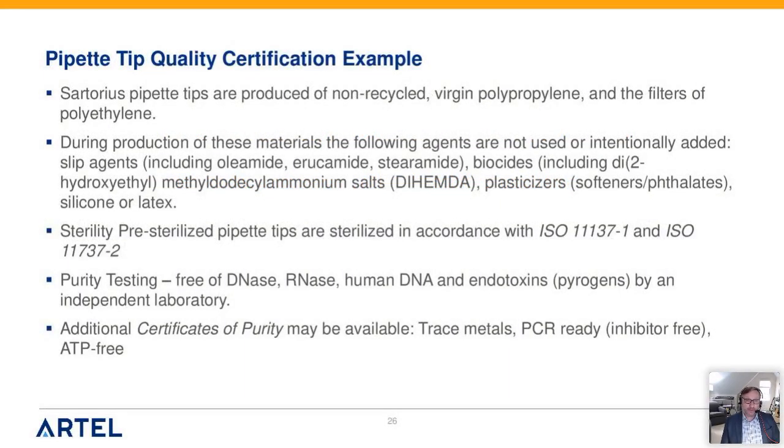I do want to point out here that the good reputable dealers and manufacturers of pipette tips, Sartorius is an example here. I'm not a proponent of using them necessarily, but this is a good example of their quality certification, and that's really what I wanted to show here. They'll talk about all of these.